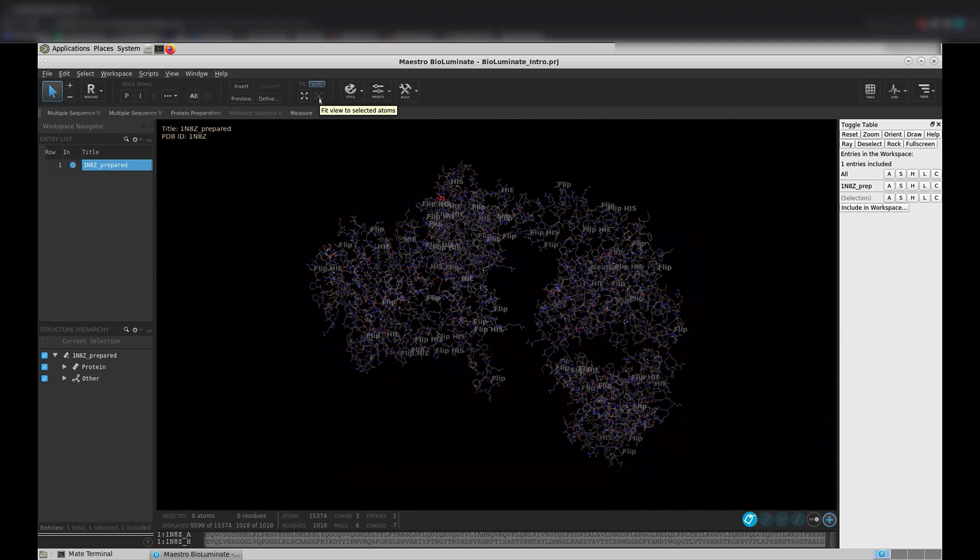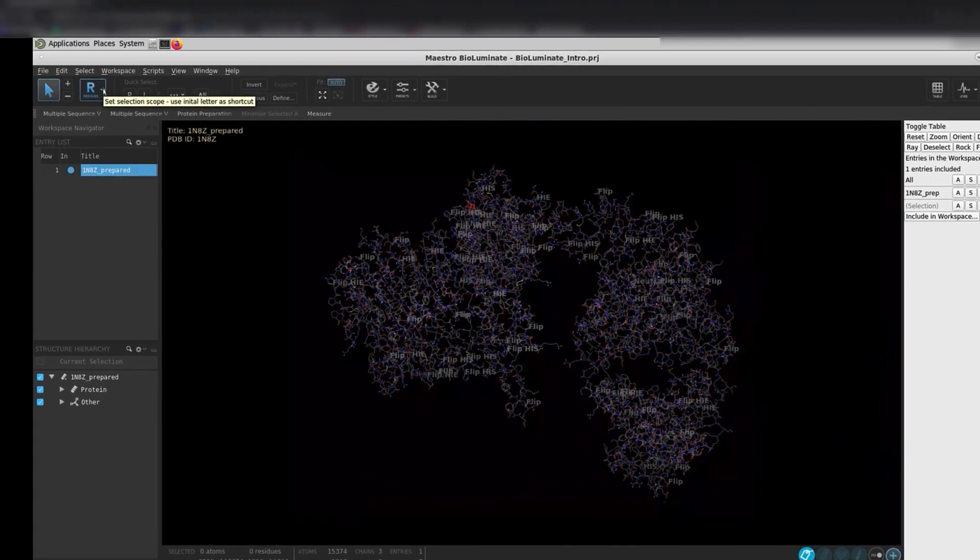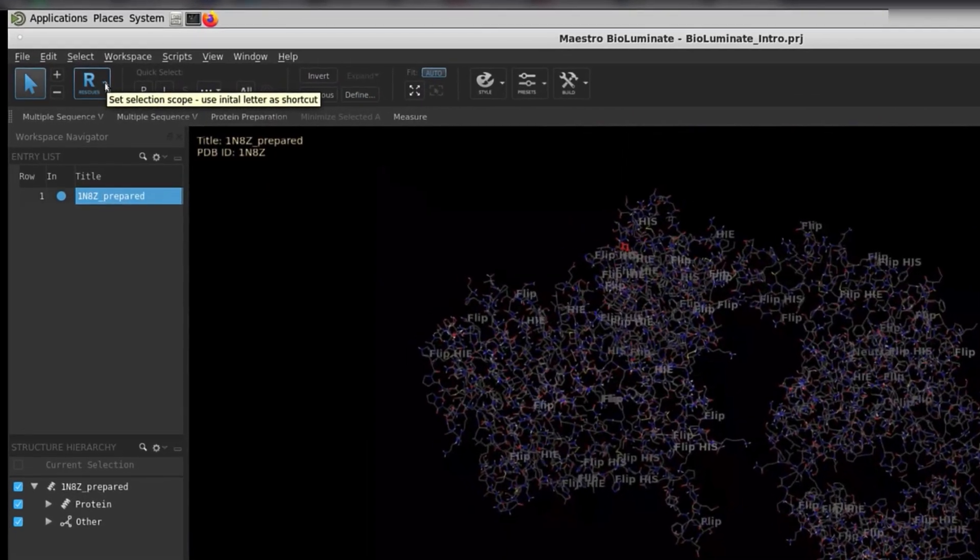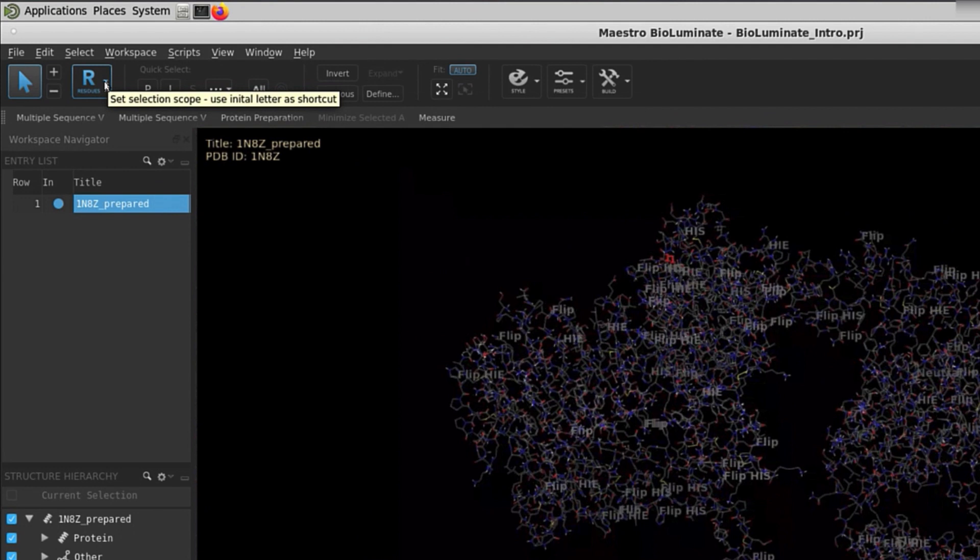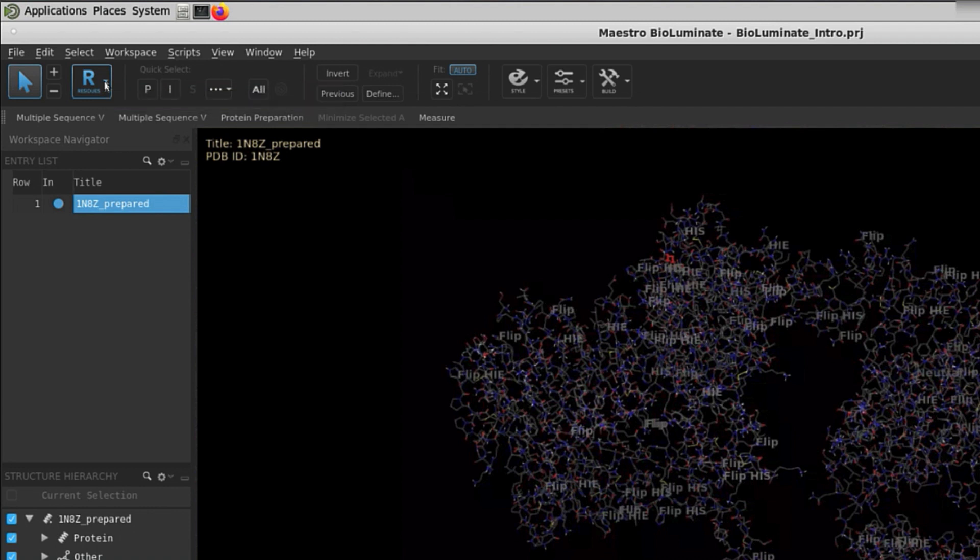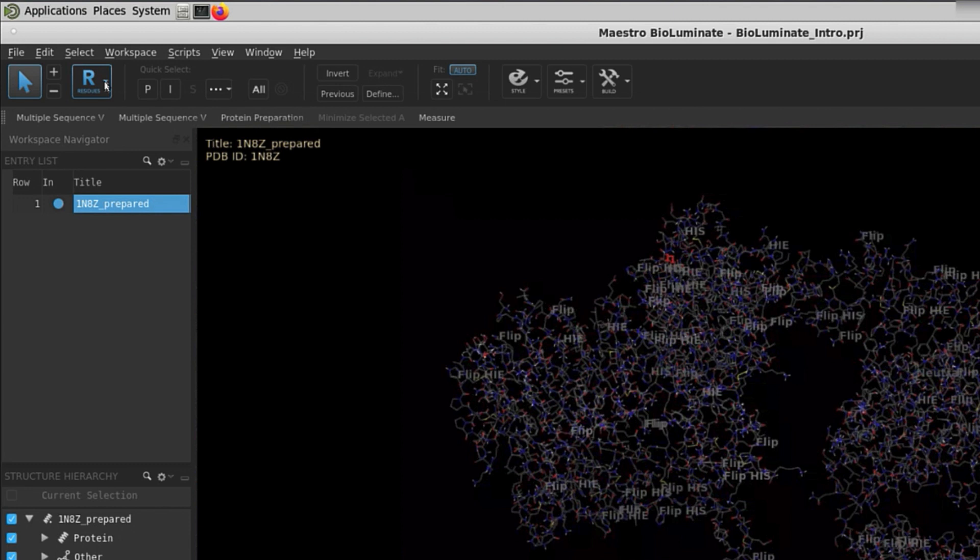Now that we have covered mouse actions and zooming, we can move on to selection. Currently, we are on the residue selection scope. This means that we can choose at the residue level within the workspace. Once more, if you hover over different buttons, a tooltip will appear telling you exactly what that button is for.